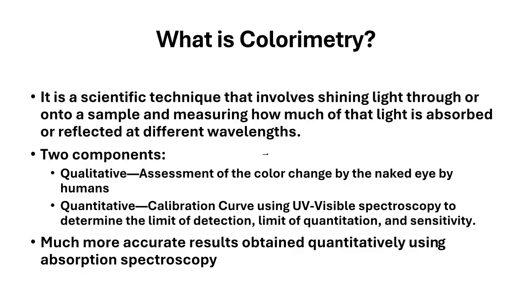by the naked eye, while quantitative measurements can be conducted via changes in the absorbance spectra using UV visible spectroscopy or by measuring the aggregation factor as a function of the bioanalyte concentration. Quantitative measurements give information on the limit of detection, limit of quantitation, and sensitivity of bioanalyses.